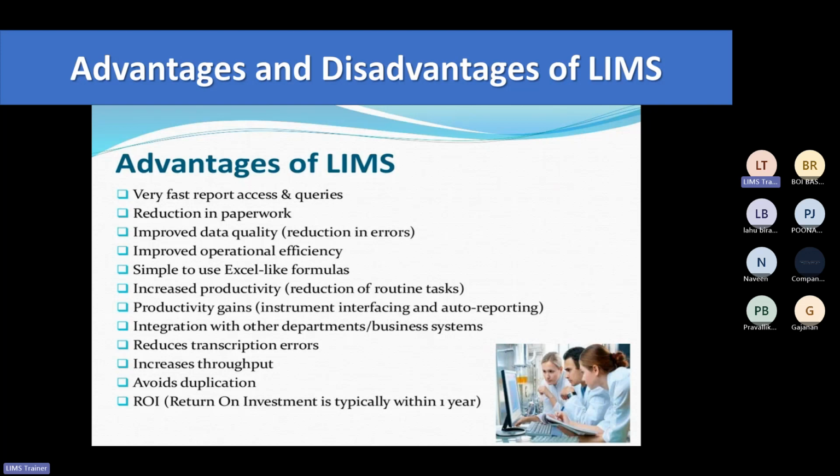Now some advantages. This is very basic. If you are already working with the laboratory, you understand this, right? So why is it important for the laboratory? It provides very fast report access and queries, right? Whenever you put some query there, it will generate the result instantly. Then paperwork will be reduced. Data quality will be improved. So you all understand this, right? That will also be involved in the course.